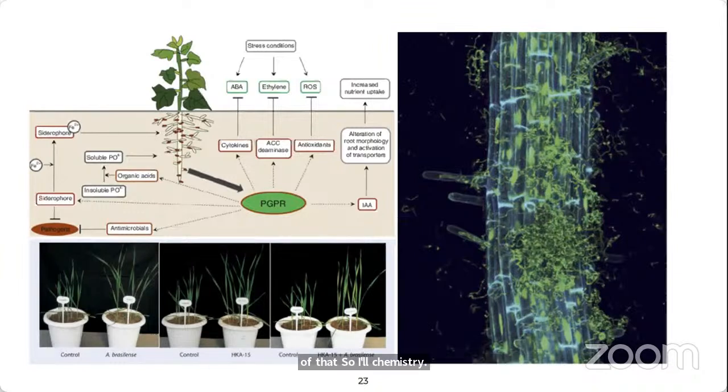And understanding the mutability or mutation in all the positions of this rhizobacteria genome can actually help us understand the variety and variation that is present in several different rhizobacterial genomes specifically.